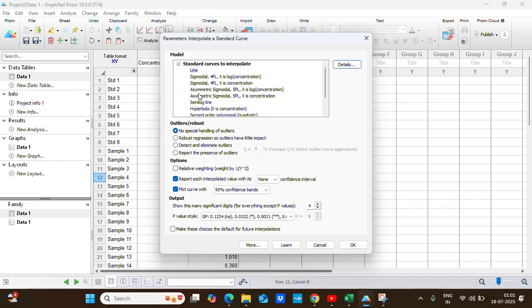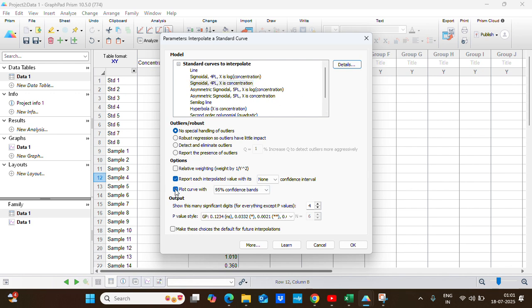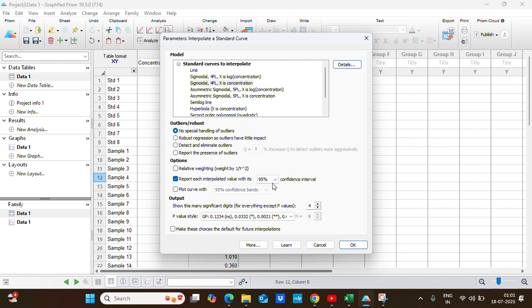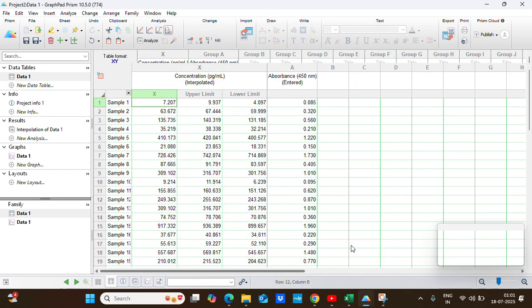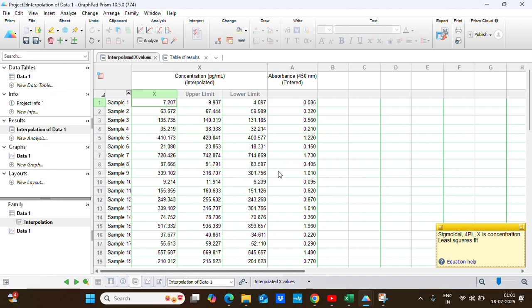For my data it will be sigmoidal where X is in concentration. I do not want to plot curve with 90 percent confidence band, and I want to interpolate all the unknown values with 95 percent confidence interval. So I will check this option and I will click OK.